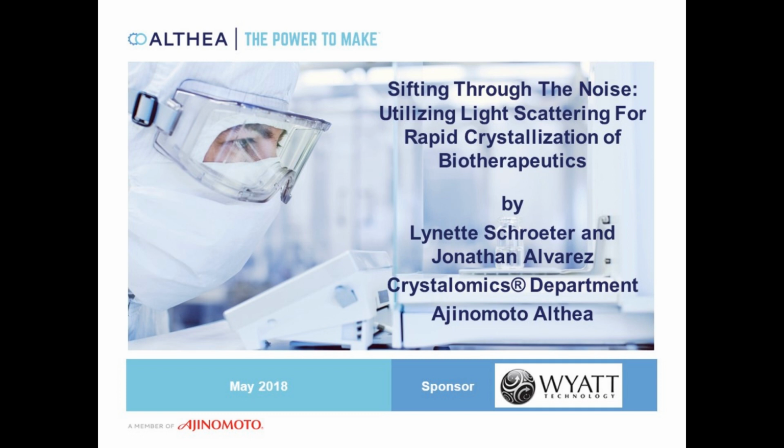Thank you for the introduction. I'm happy to be here today to talk about dynamic light scattering and how we use it to rapidly determine crystallization conditions for biotherapeutics here at Ajinomoto Althea.